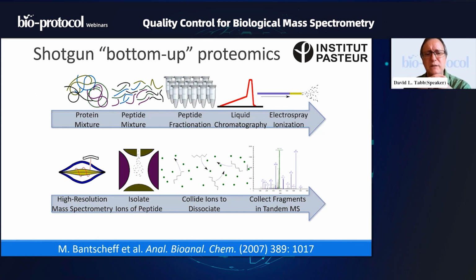So let's start with a protein mixture. If you dump out the guts of a cell, how many proteins or how many proteoforms or how many different genes, gene products are represented in that mixture? I think that I can say without fear of contradiction that when you dump out the guts of a cell, you have more than 10,000 different proteins represented. And that's just counting the number of accessions.